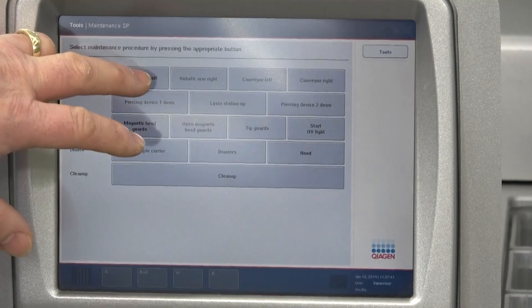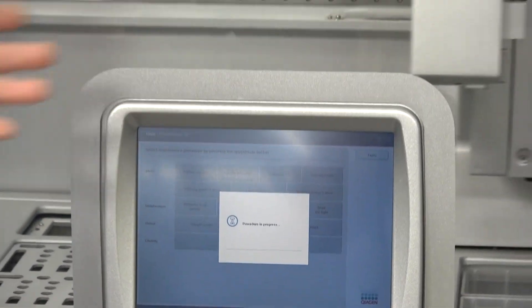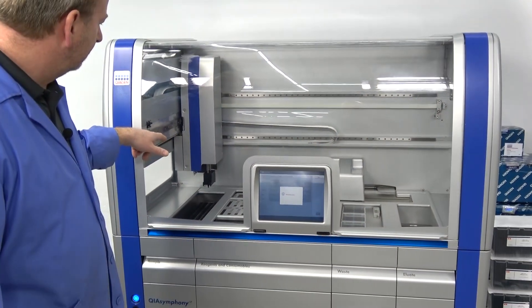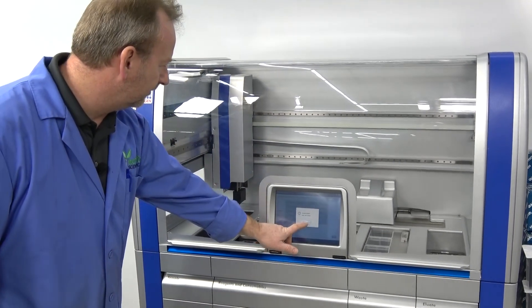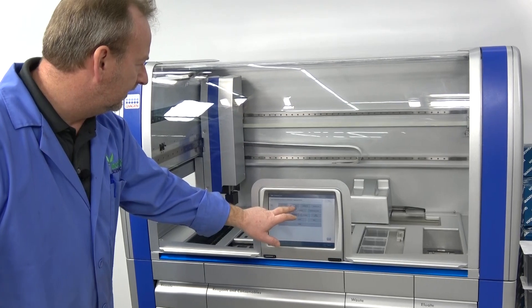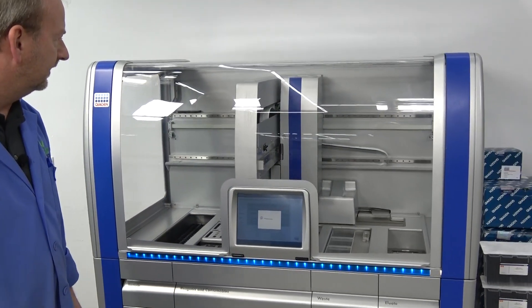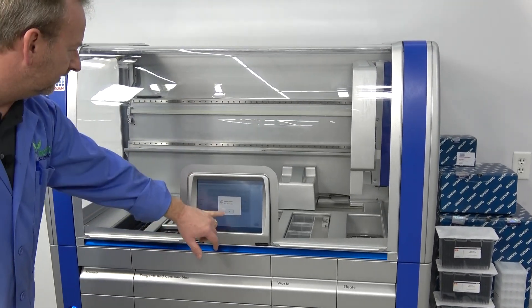I'm just going to do a quick run of the robotic arm to the left — and it just comes over here. It does have a laser guiding system that monitors as it's going through, and it just says procedure complete. We push OK, and again I can go back right with the robotic arm. You can see it runs really nice and smooth, and it parks over in the corner again.